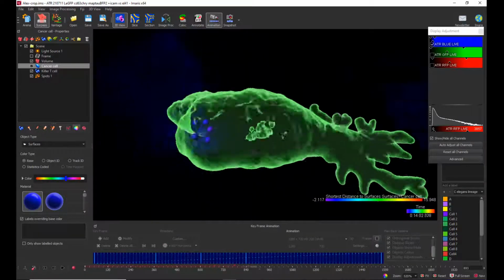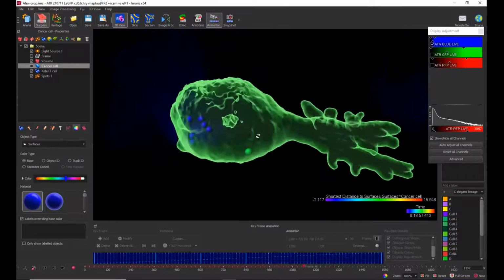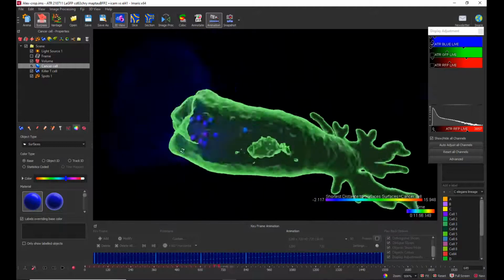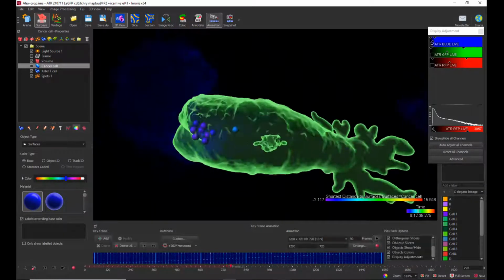So we can see that when I play the preview, now I animate both movements. One is the initial timeline and then some actions which I introduced on the scene: zooming in, rotation, and disappearing of the surface. Here again, the number of frames should be adjusted to the number of keyframes added and the desired speed you want for your movie in the end. So to remind you, 120 frames will be 5 seconds in reality.